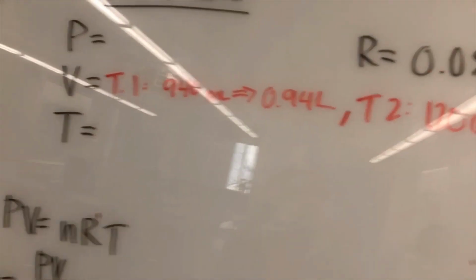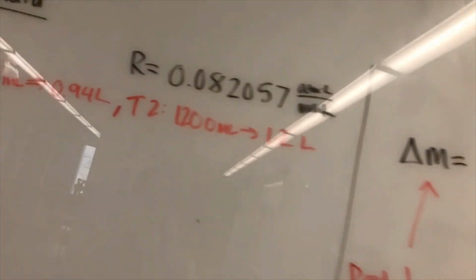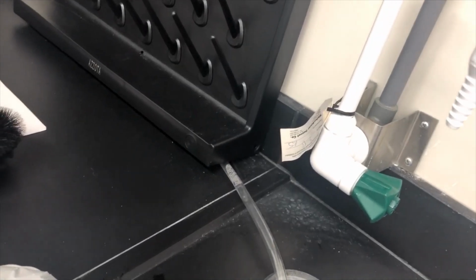Since there's such a big difference between those 2 numbers, I'm actually going to now do a 3rd trial just to really ensure we're getting you guys some accurate data.